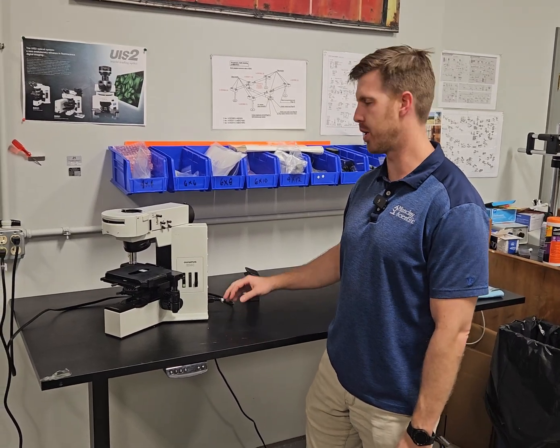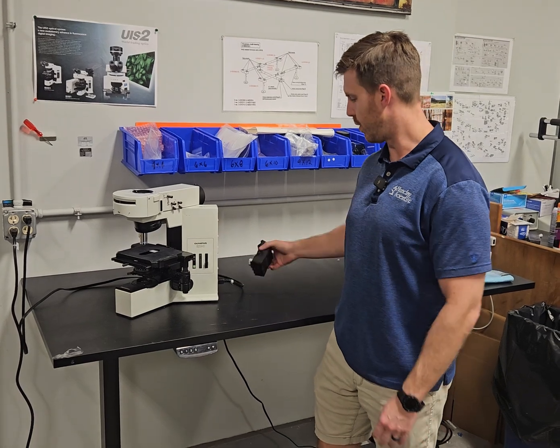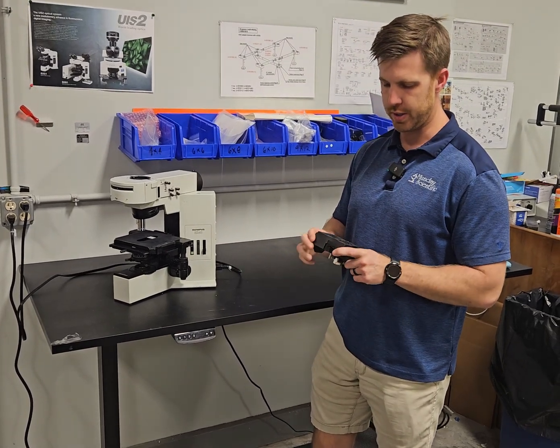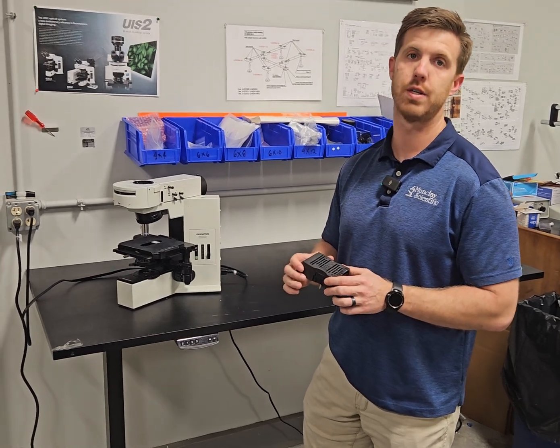Hey, this is Chad with Munday Scientific. Today we're going to talk about some lamp houses on the BX40. This lamp house right here is the replacement — it's the U-LS30-4.